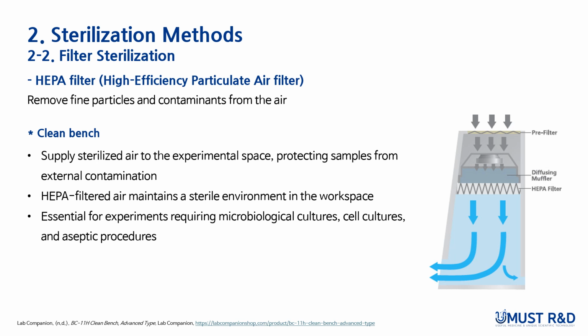In this lecture, we learned about the importance of sterilization in microbiology and explored two common methods, autoclave and filtration. These techniques help prevent contamination and ensure accurate experimental results. Proper sterilization is essential for maintaining reliable and reproducible outcomes in microbiological research.